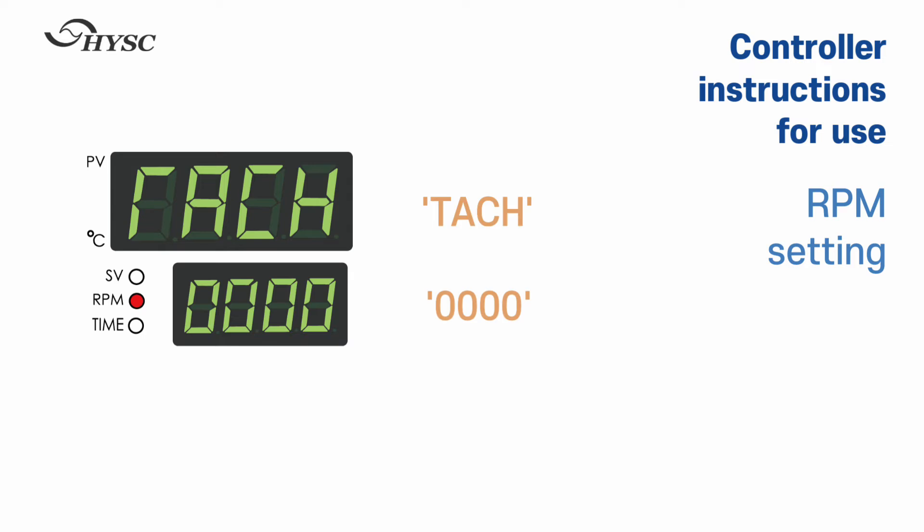TACH is displayed on the upper screen. TACH is abbreviation for tachometer.